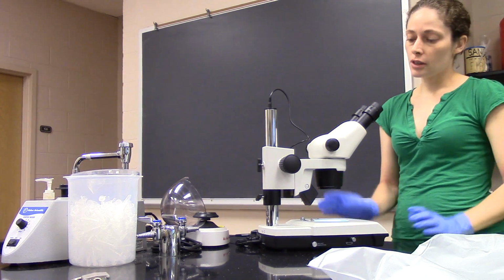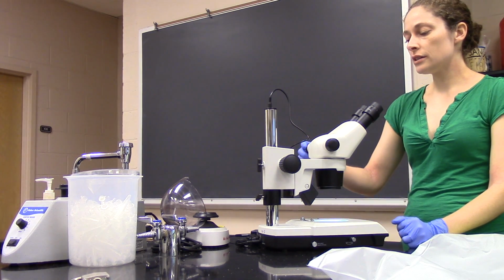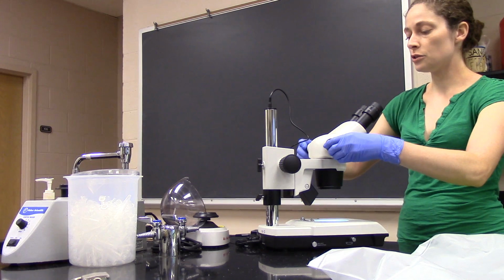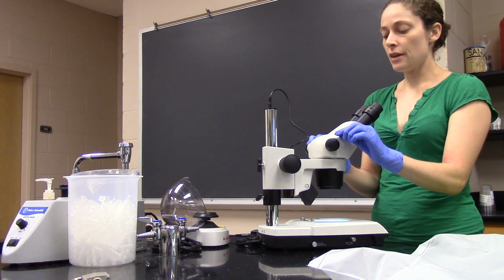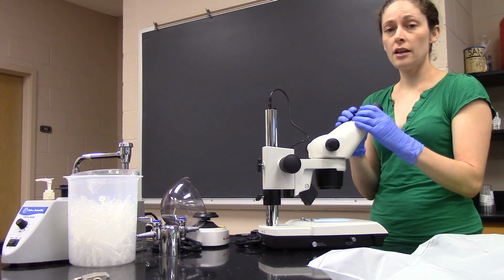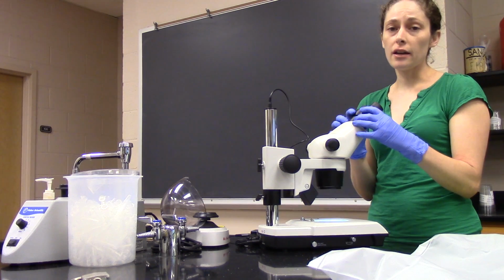Okay, so before you start looking at anything under the microscope, you also want to set this dial to 1. This is the magnification control. When it's set to 1, that 1 is multiplied by the 10x magnification in the ocular sphere. So this 1 actually means 10x magnification.